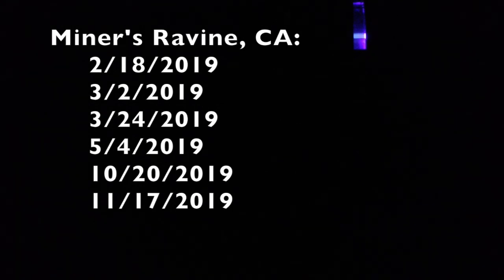Here at Miner's Ravine, we can see a very prominent fluorescing line right through the top of our sample. I ordered these video clips of water collection from the least bright to the most bright.